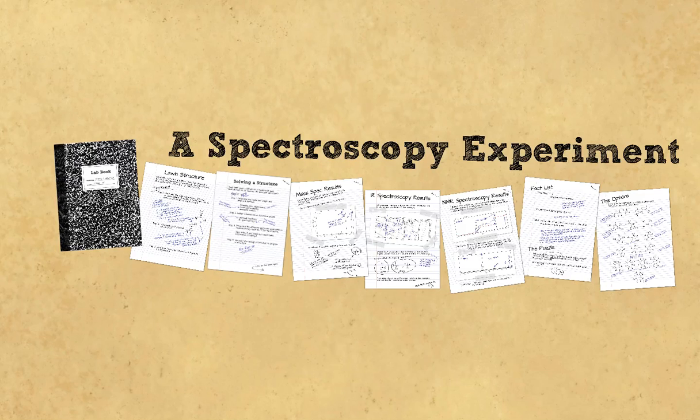But mass spec instruments, or at least mass spec instruments that can do ion trap methods and more sophisticated fragmentation experiments, are even more expensive than that NMR I was talking about. And they definitely need a guy who knows what he's doing. So you're paying another salary there as well. But if you're in a large institution and you've got a mass spec department or a mass spec facility and an NMR facility and experts in there to help you out, you'll be able to elucidate the structure of just about any molecule you come across.